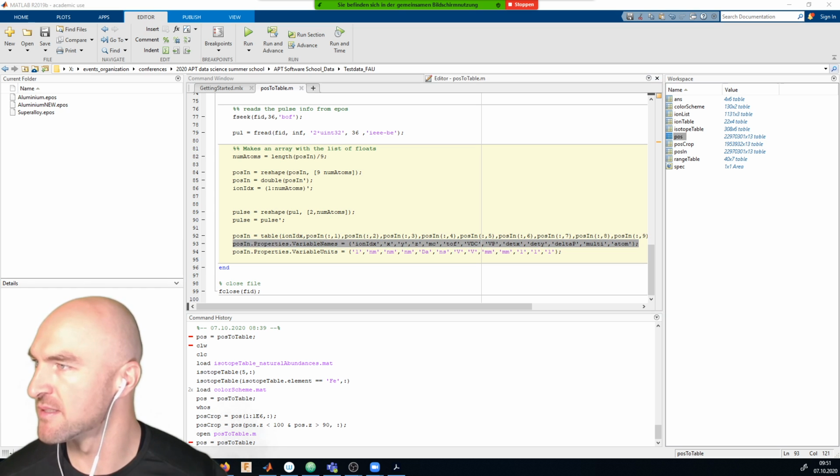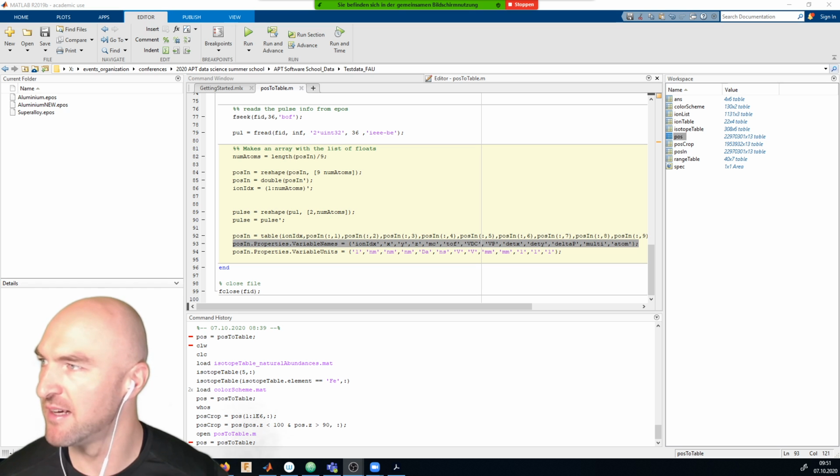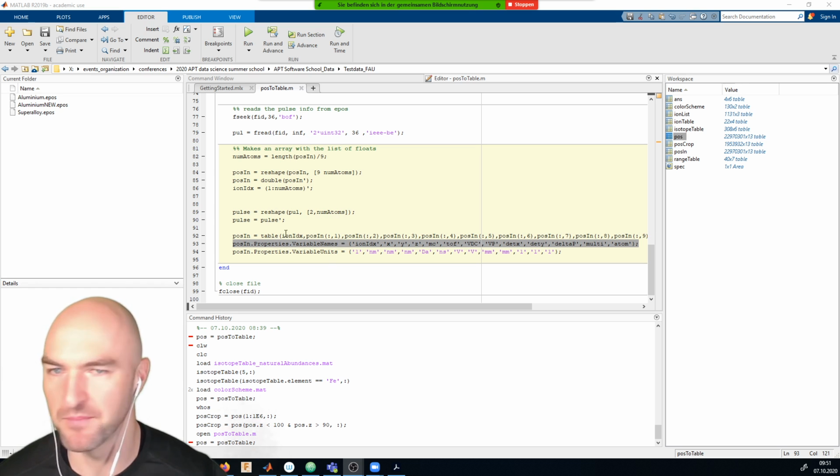Okay, so Renel is so far the only red one I see. Maybe Renee, you can ask one of our helpers, like Martina or Valentin, that can maybe work with you and get the script working for you.